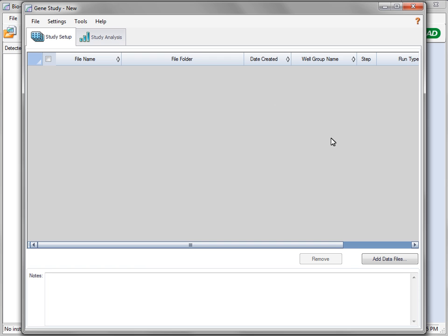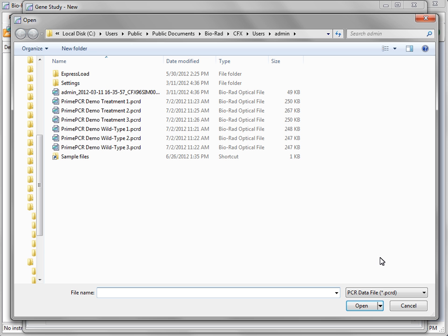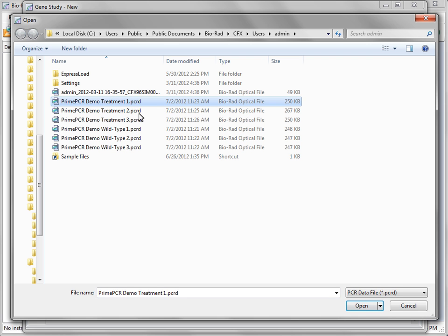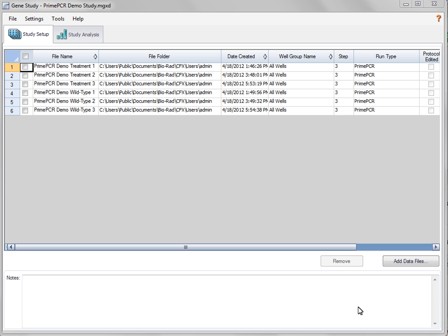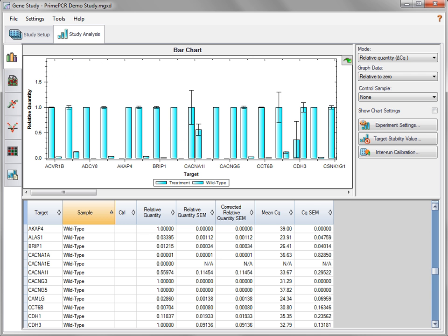Select data files to add. Select multiple files at once by clicking and holding down the Shift or Control key if the files are not adjacent. Begin gene expression analysis by clicking the Study Analysis tab.